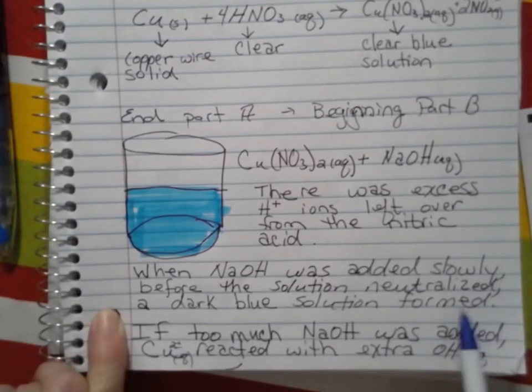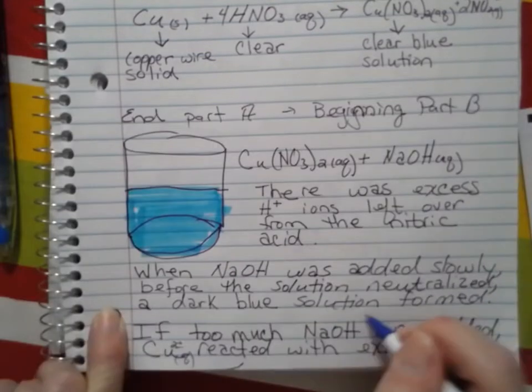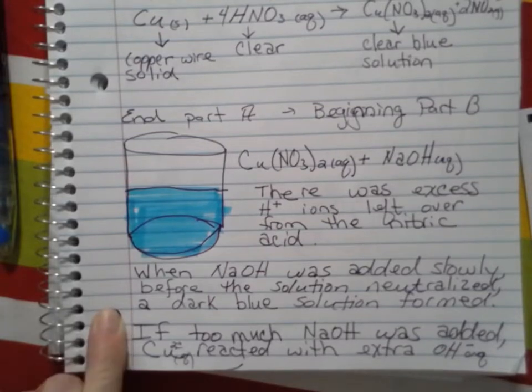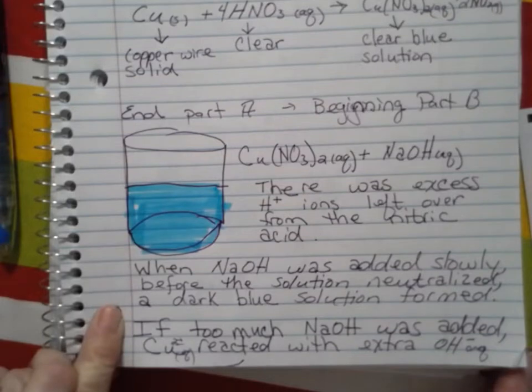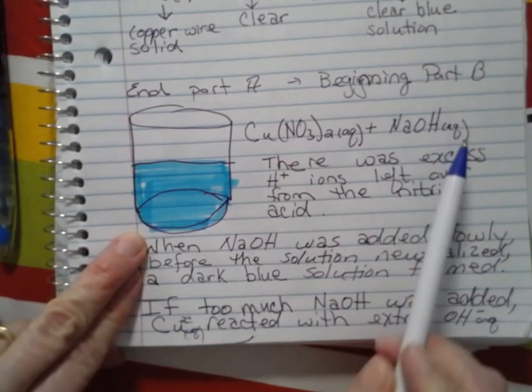Okay? So if you'll notice, the sodium hydroxide, it was 6 molar also. So we had the same ratio, 6 molar nitric acid to 6 molar sodium hydroxide. So they could cancel each other out or neutralize each other. So at this point, this was a neutralization reaction.